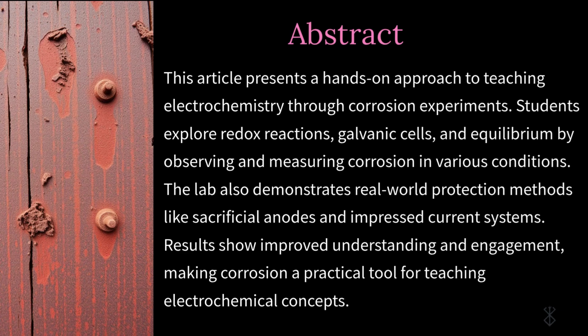So, I'm going to talk about the abstract. Electrochemistry is often considered one of the most challenging topics in general chemistry, as students tend to master quantitative calculation while struggling with conceptual understanding. This article presents an innovative laboratory approach that uses corrosion experiments to teach fundamental electrochemical principles, such as redox reactions, standard reduction potentials, galvanic cells, and chemical equilibrium, rather than focusing on batteries.